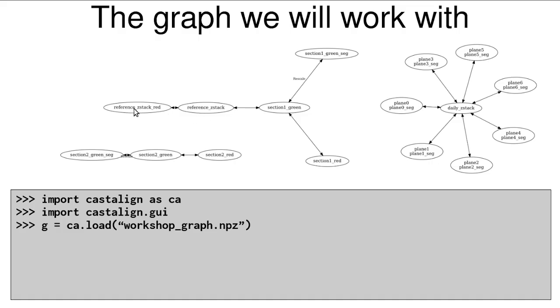We're going to have this other one, which is where we have a reference z-stack right here. And we're going to have a red version, and then this one is the green version. And we're going to have that already registered to section 1, just as a demo to make this easy. And then second, we're going to have this section that we haven't registered yet. And this is the one that we'll register together. So we're going to do a couple things together.